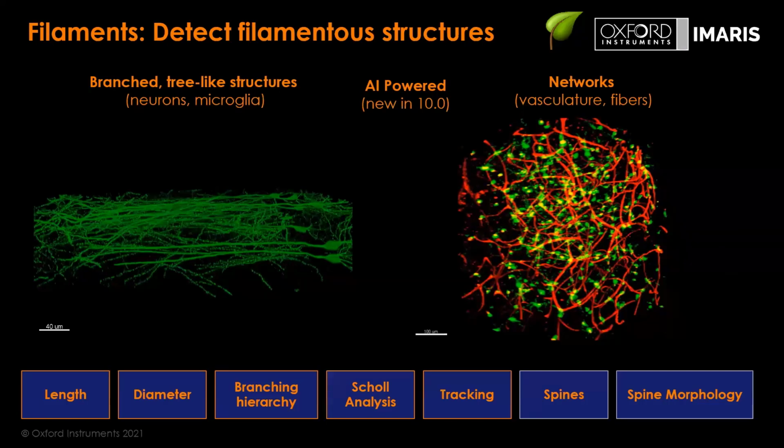Or if you want to have the spot data itself, you may be able to open it in a different software, you have different bridges here. And just the spots typically should be very small, so definitely in the megabyte range. But if you have, let's say, a 10 gigabyte data set and you do spots, typically it's a little bit larger, like 11, 12 gigabytes, depending on the data, but you don't need any dedicated USBs or anything to do it. I mean, USB-C, SSD, a solid state external drive will just make your life easier because it's faster, but you can use any type of connection to transfer things.